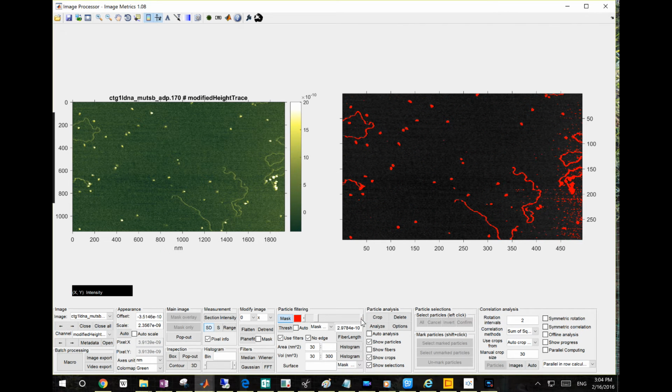basically, if you want to preserve precision, this is the automated way you want to do it, because when you're flattening, you only want to flatten the surface, right? You don't want to flatten your DNA molecules, because the DNA molecules, protein molecules, are basically outliers compared to the surface. If you don't use the mask flattening, if you don't exclude them, they basically will screw up your flattening parameters, and it will make your surface a little higher and lower, so now it's exactly zeroed.